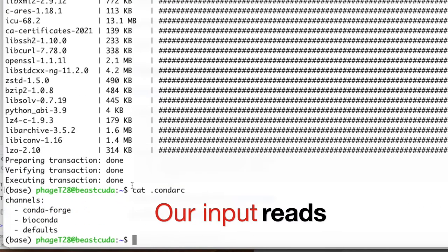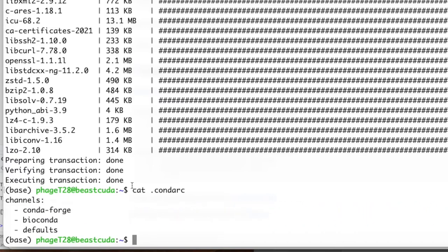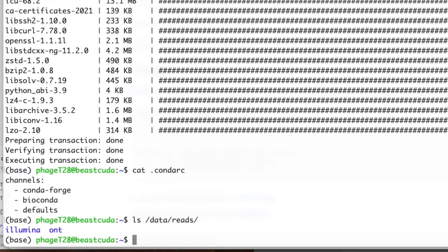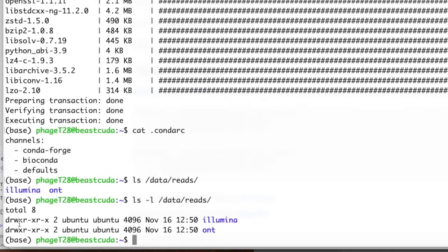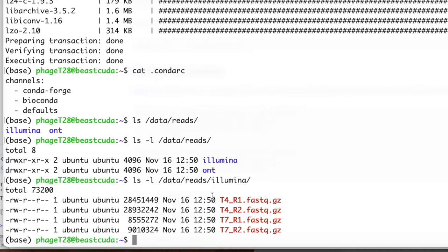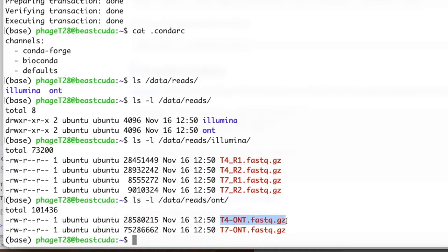In our server we already have some reads in the /data/reads directory. Using 'ls /data/reads', we see two directories: 'illumina' and 'ont' for Oxford Nanopore Technologies. Adding the -l switch gives more information — the first character shows whether it's a directory or a regular file. Inside illumina we have paired-end sequencing — two files, R1 and R2, for both T4 and T7 isolates. In ont we have a single file per sample; all files are in FASTQ format.